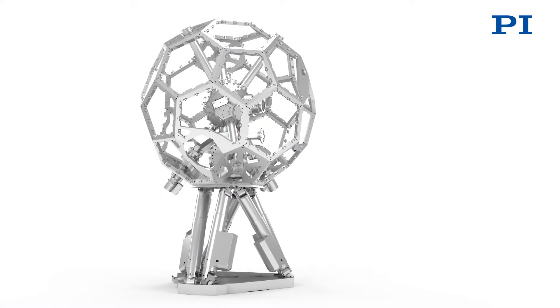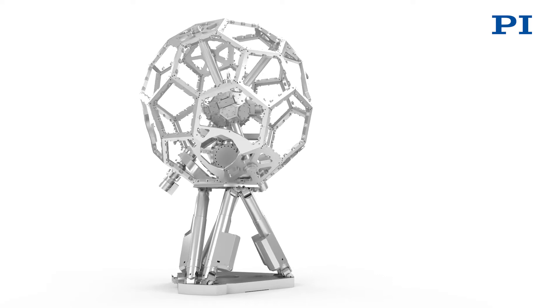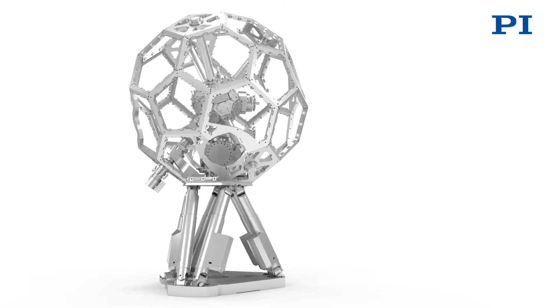What would the application demand from such a system? The system has six axes and can therefore move in six degrees of freedom. Why exactly is this necessary? Various points on the sample surfaces need to be illuminated from various different angles. But because the sample is coupled to the vacuum chamber, it is necessary to position it in six degrees of freedom.